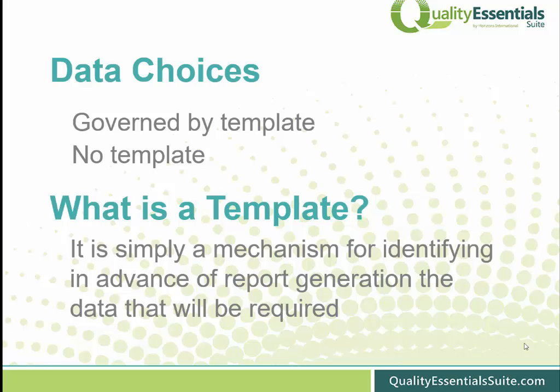Another feature that we introduced at version 17 of the product is that when data variation does not exist, the user can omit the step of template creation. Let's take a look at how templates are set up and used.